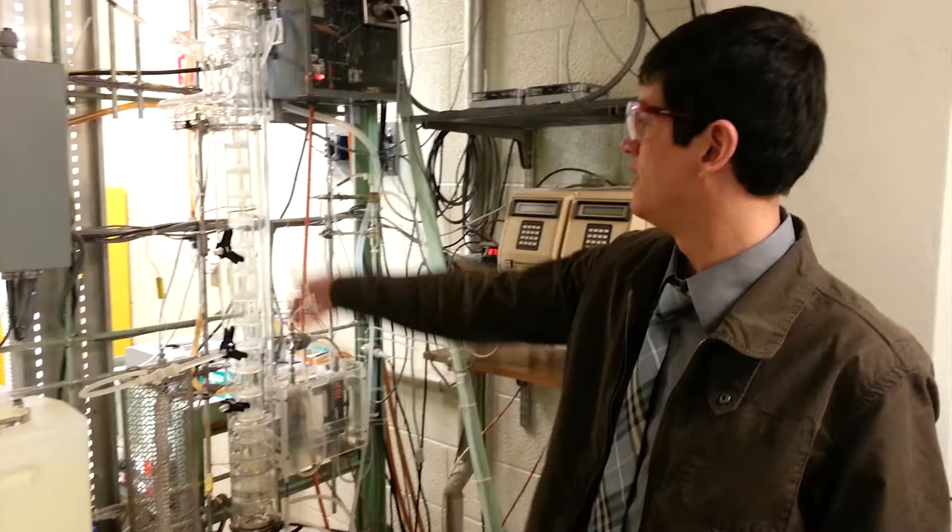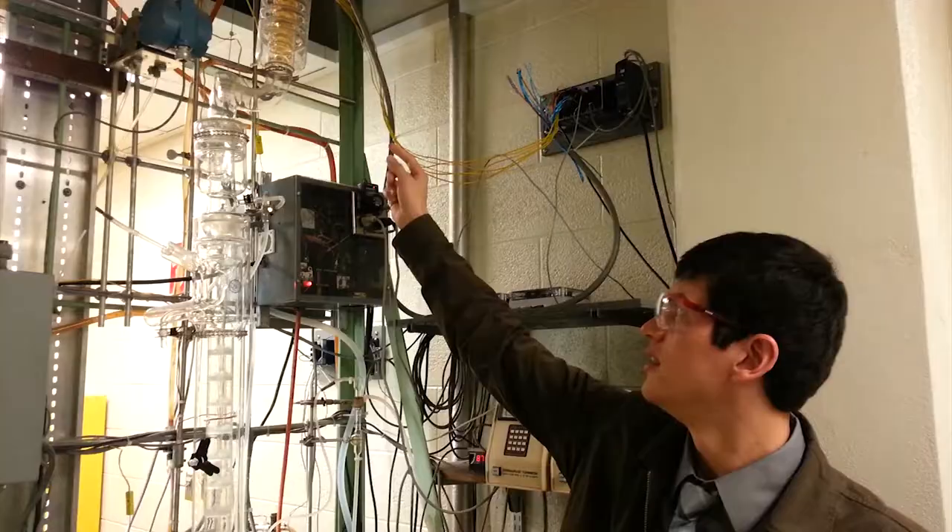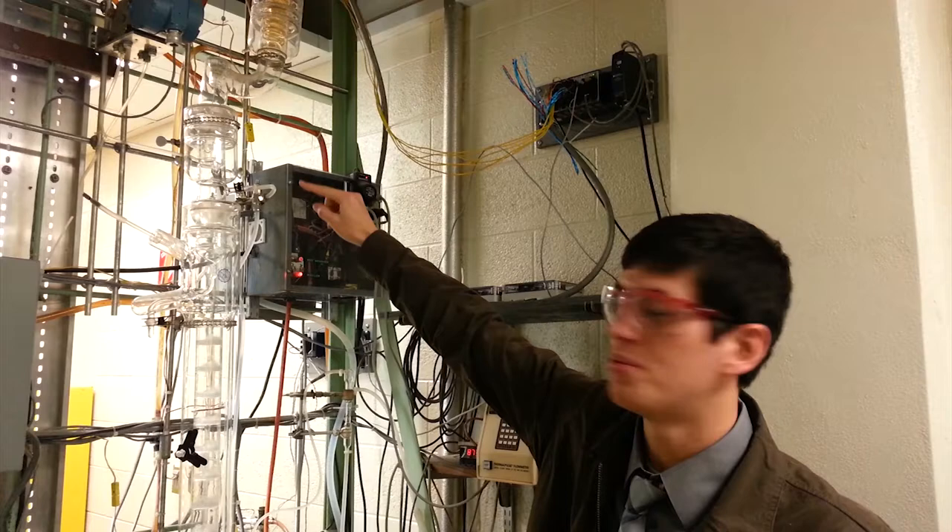It runs through the distillation column and the condenser is all the way up there with those coils. It refluxes up there and the distillate comes off the top back side of it over here, and it runs eventually down into this tank down here.